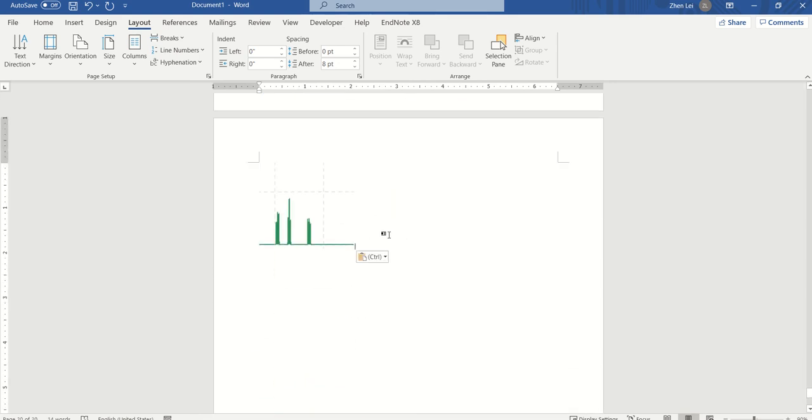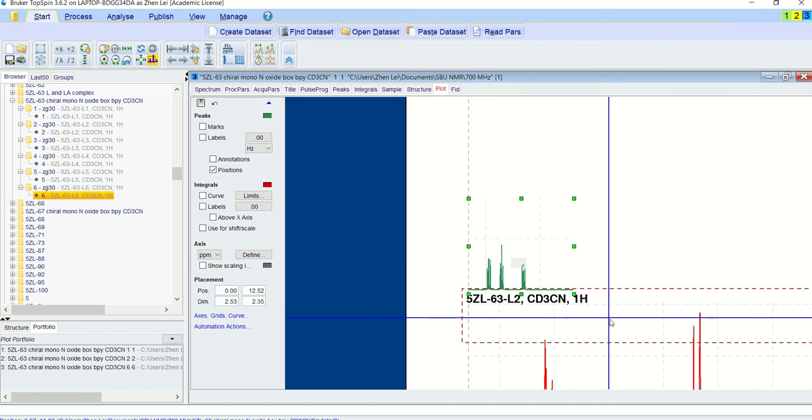Now you can see that this one covers almost half of this paper. That looks pretty fine. Normally you can just change it to be a little bit wider to occupy half of this column, and it looks nicer. Then you do the same thing for the next one.